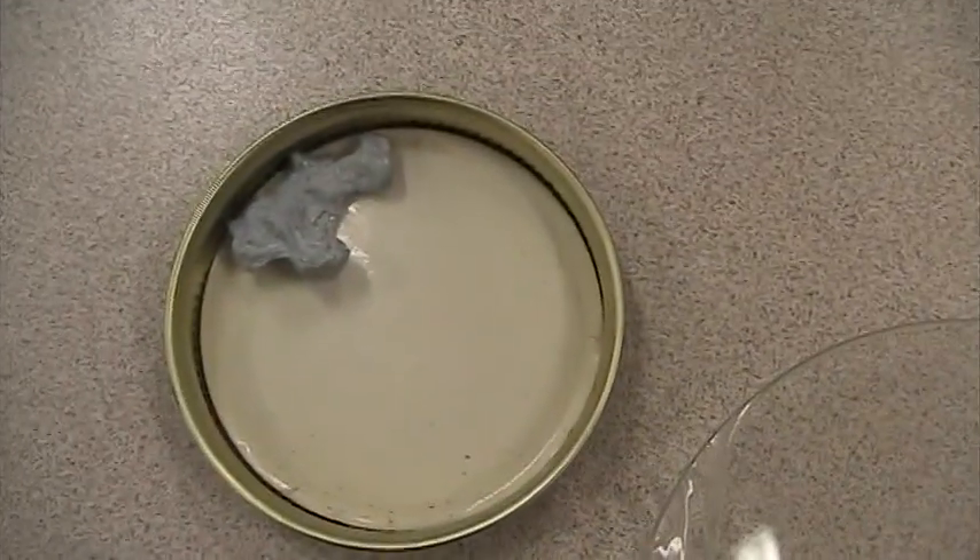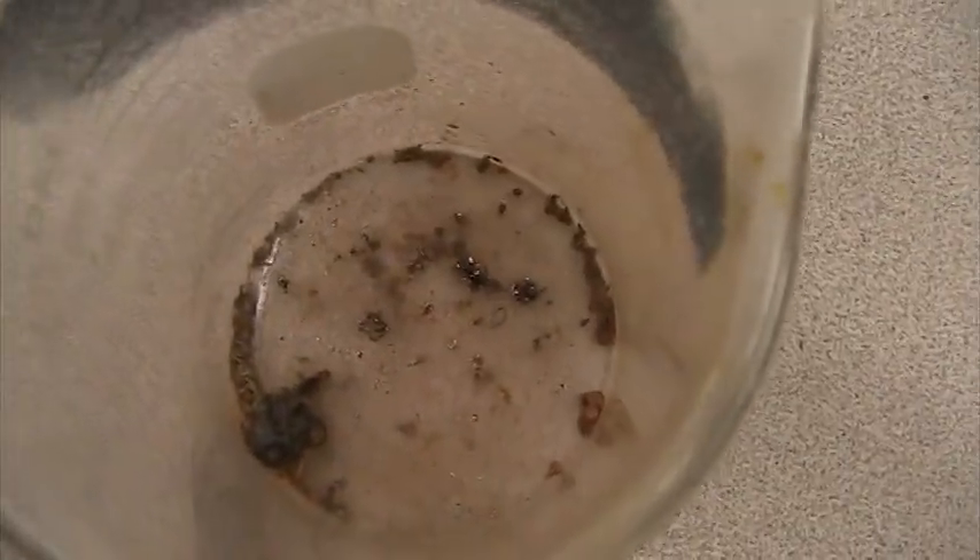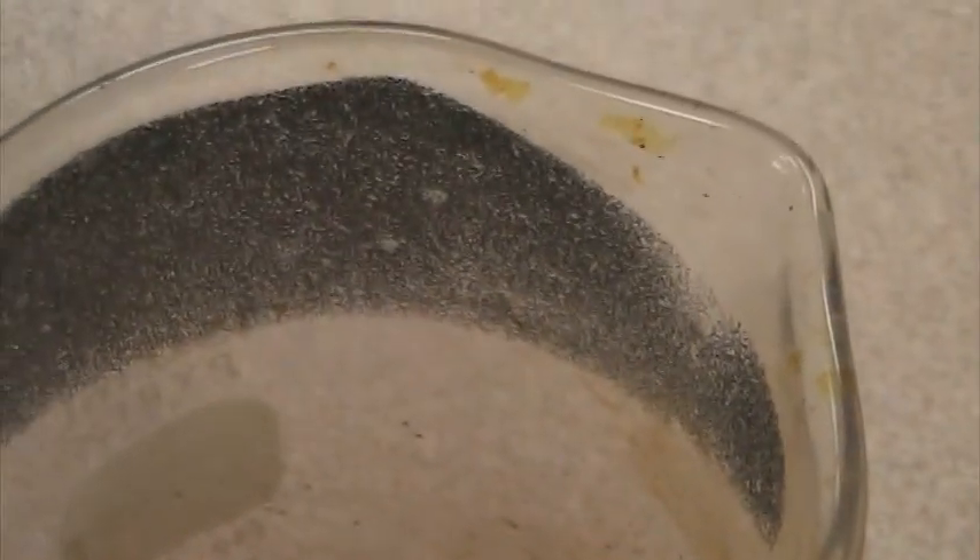So the zinc used to look like this, and now it's covered in some other kind of material, and that would be the zinc iodide. I'm not sure what this residue here on the side is — that's probably crusted iodine.